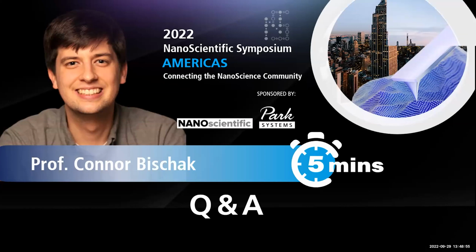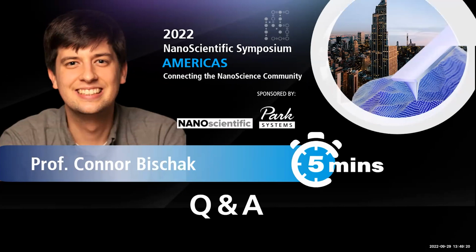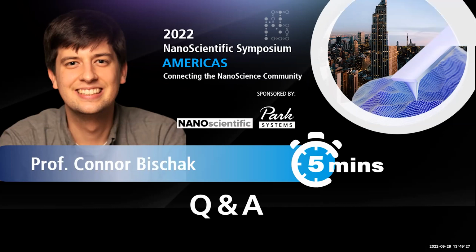Hi, Connor. Yeah, a great talk. So I was fascinated by your video of the ion wave moving through the sample. I couldn't read exactly the time scale on the top, but approximately how long did it take you per image? So this is a pretty slow ion migration. I think each image was maybe 2 minutes or so. Okay. And here we're essentially parked at one wavelength, so we can image quite a bit faster. Okay, got it. Thank you.